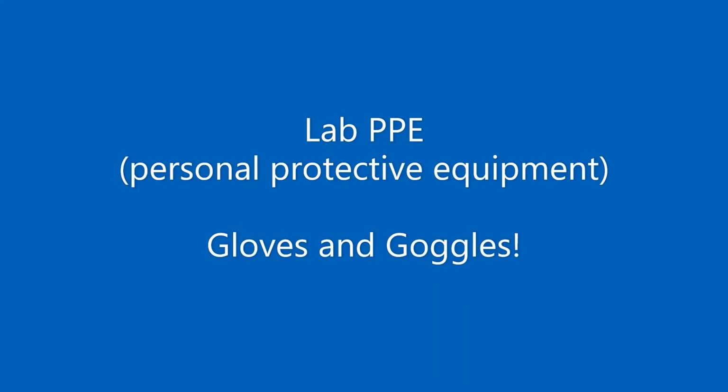In every lab, you are required to use the proper PPE, or personal protective equipment: gloves and goggles.